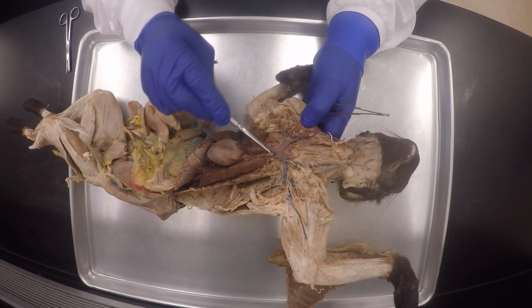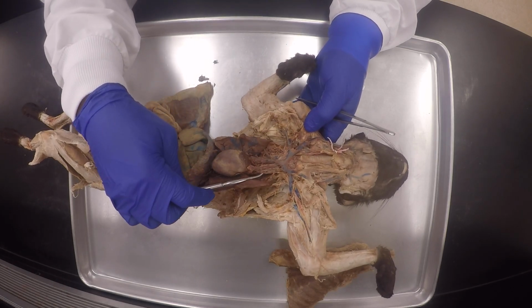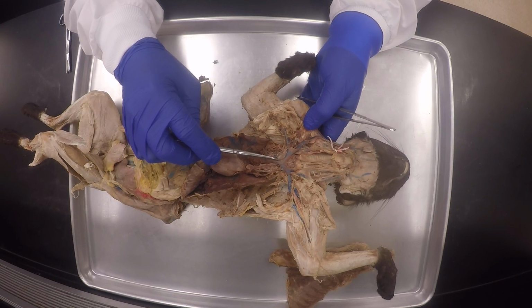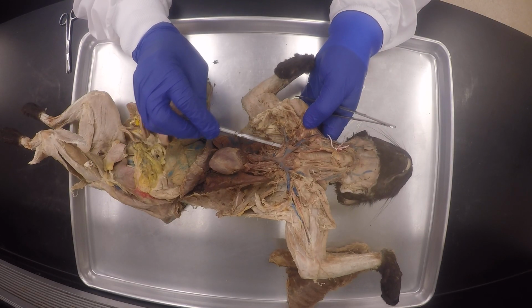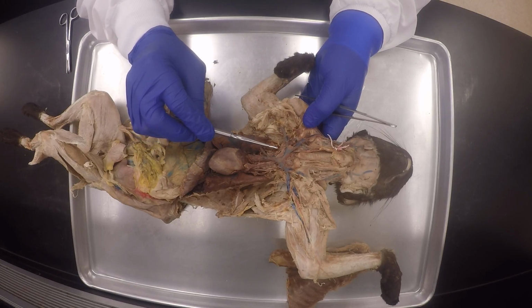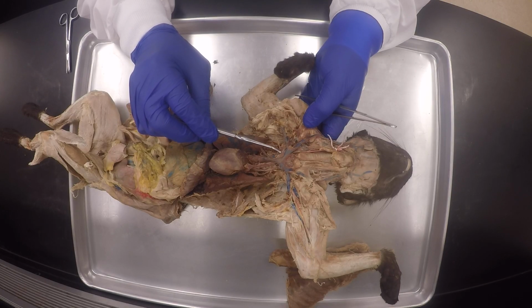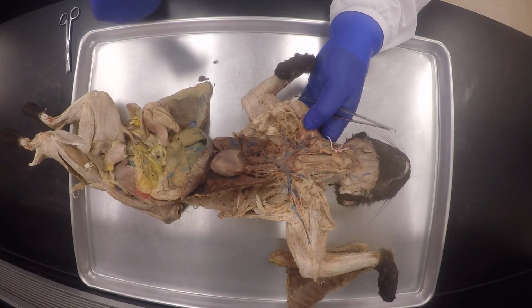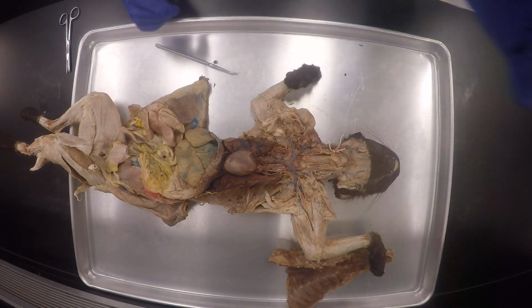There's the left subclavian artery, and then there's the right subclavian artery, and we saw the internal mammary arteries on both sides, and they do look like nipples, which should remind you. See, there's that internal mammary artery on the right, internal mammary artery on the left. Okay, so I'm gonna call it a day and stop it right there.